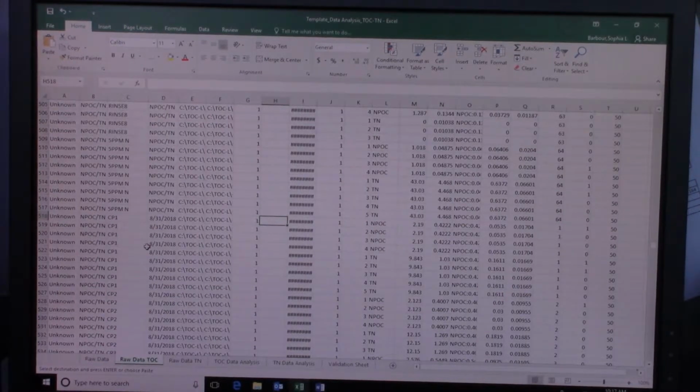To merge cells, you type equals, then click on this cell, then a quotation mark, and I'm going to put a space and maybe a parenthesis, and then a quotation mark, and then the date, and a quotation mark, enter. Oh, actually, the format's wrong.